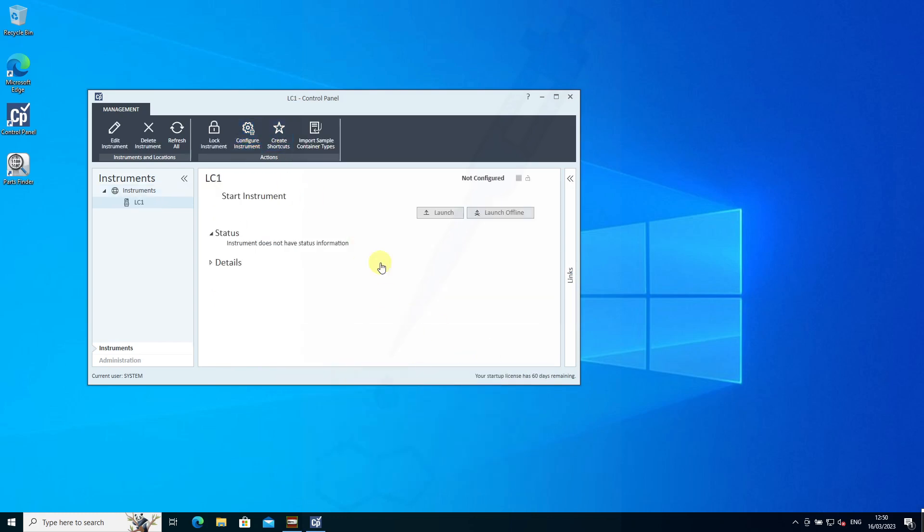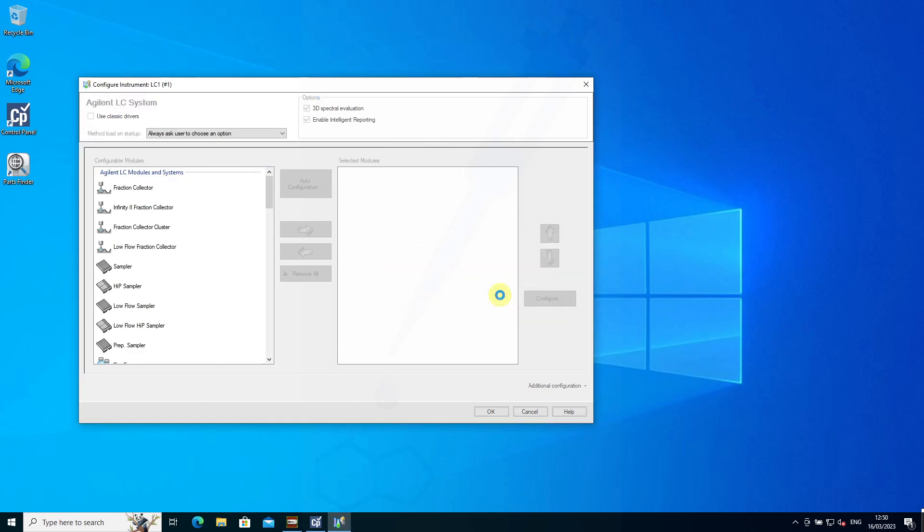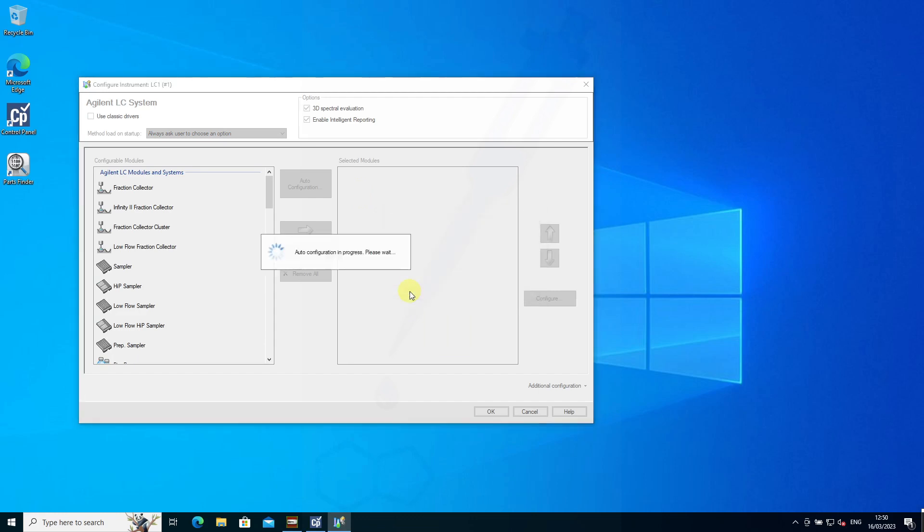Now we can configure the instrument. Yes, we want to do auto-configuration. In this case, you would plug in your IPS device—that's the address of the connection.